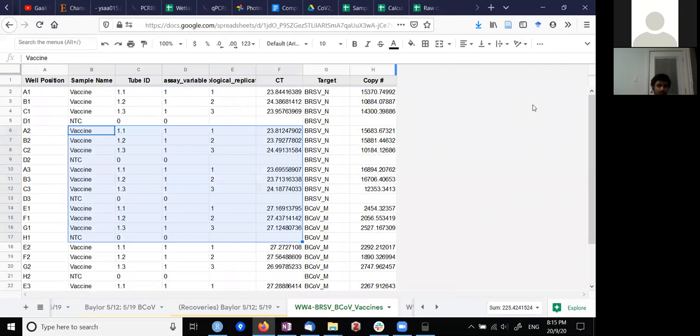Okay. Yeah, I think that's pretty much. I'll probably maybe look at some samples that were already done just to kind of go through the whole thing. Yeah, so the thing is, when you're rerunning any old data, if you want to see the output, it will ask you about overwriting the existing files. Yeah. Can I rename it so that it's not going to do that? Yeah, you can rename your files as a testing or something like that and then put the other name. So that way it will not ask you for overlapping names.